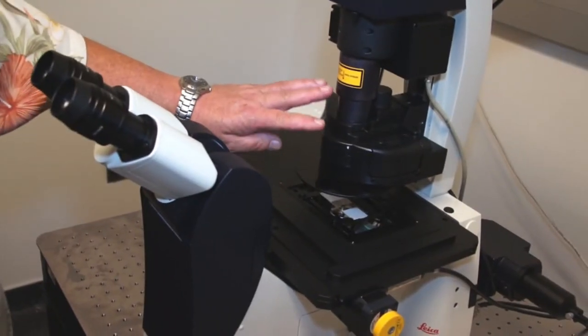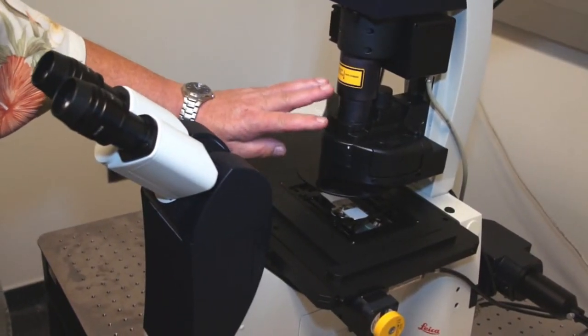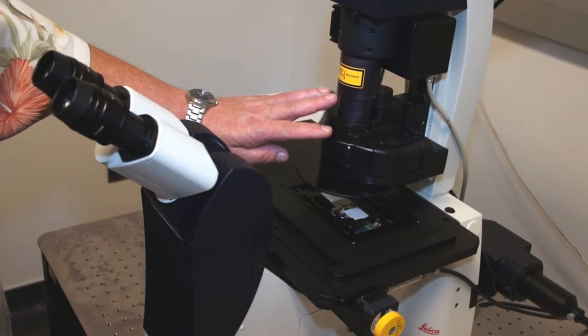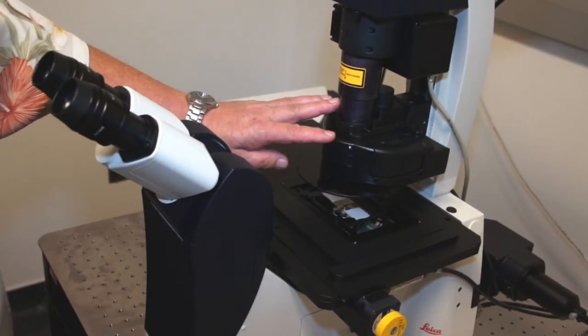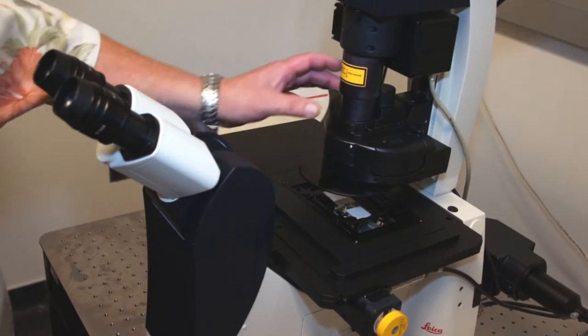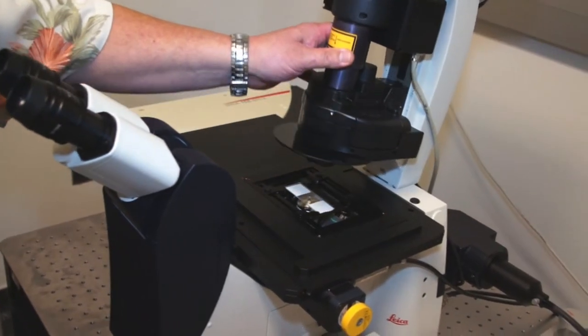As mentioned previously, we have a combination of wet objectives and dry objectives on the Leica Confocal microscope. In order to go from a dry objective to a wet objective, we must first rock the condenser out of the way.